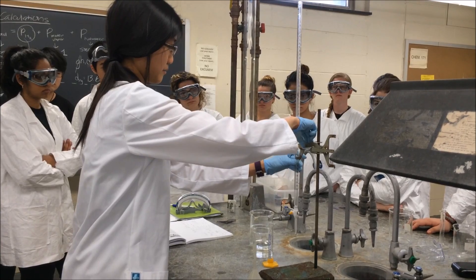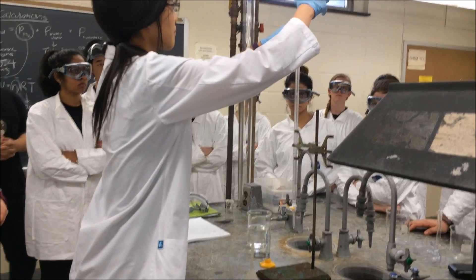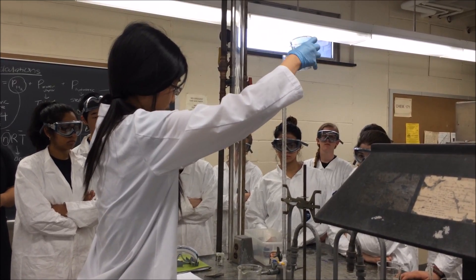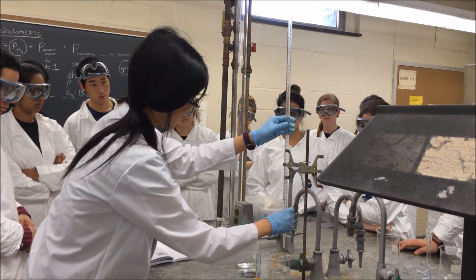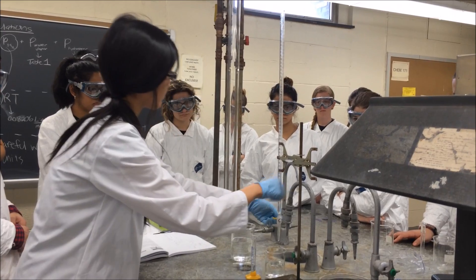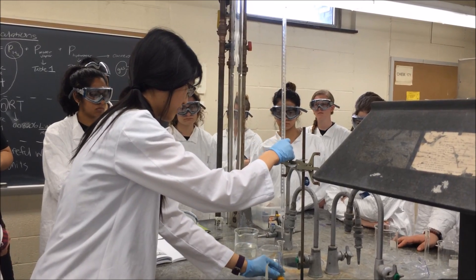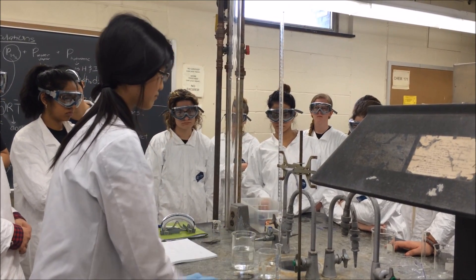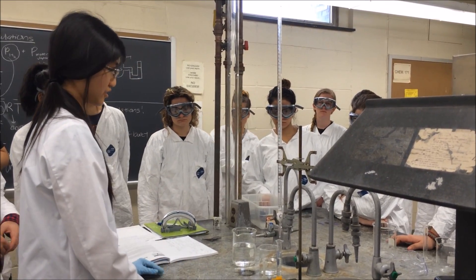To find the dead volume, make sure it's closed and fill the burette. Fill it a little over the 50 mL line, then let enough water out to reach that 50 mark. Put your graduated cylinder under it and let all the water out into that — that tells you what your dead volume is. There's a place to write that down in your book, so please record it because you're going to need it for your calculations later.